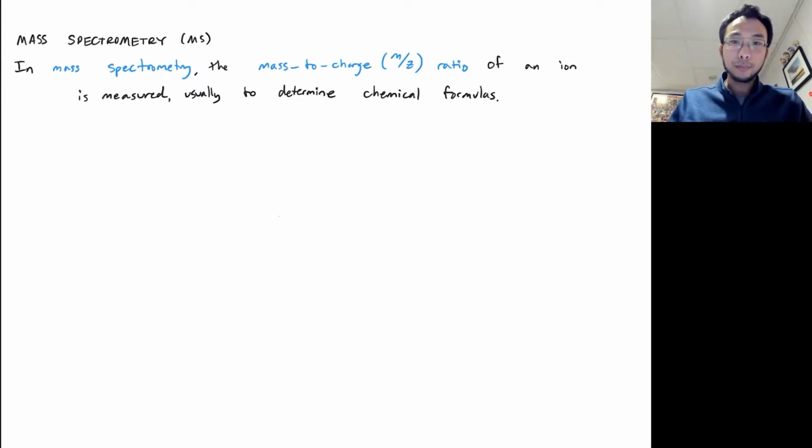In this video, we will learn about mass spectrometry and how it is used to try to estimate or guess the molecular formula of a given sample. So let's first look at how exactly mass spectrometry works.